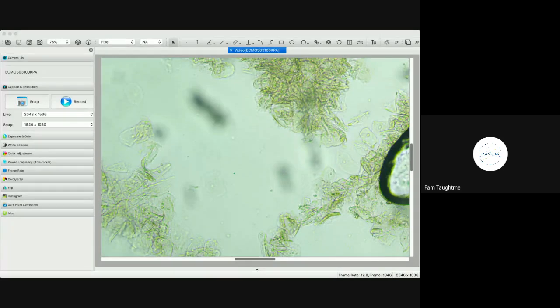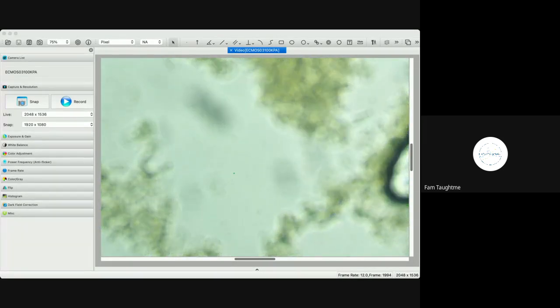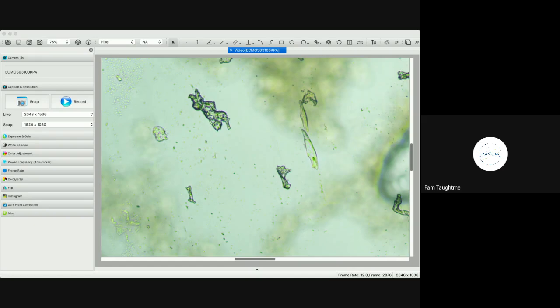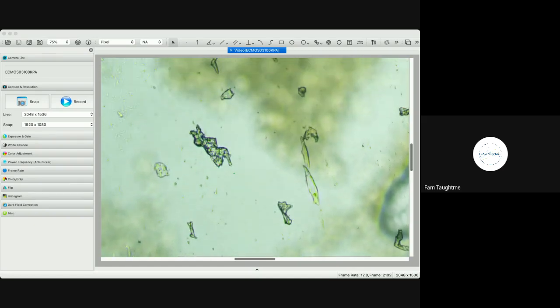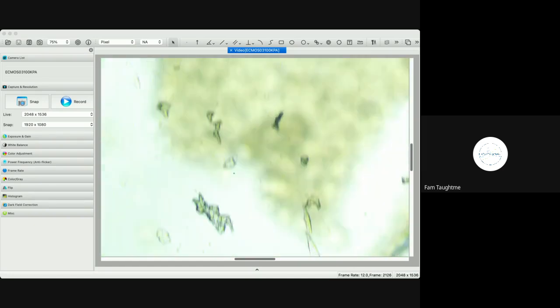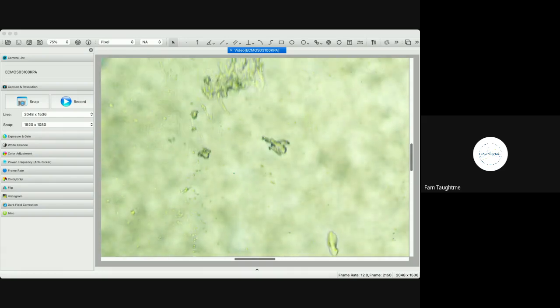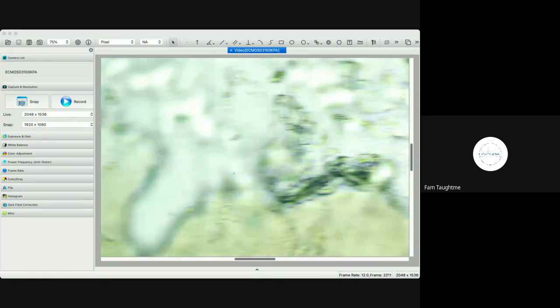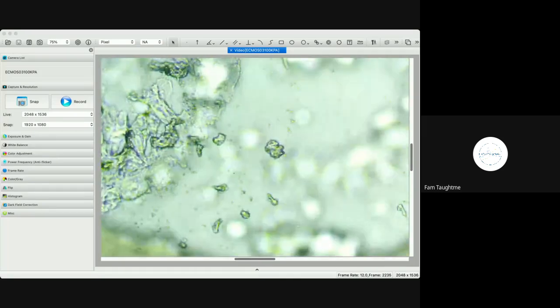Okay, so here I'm going to switch now from the cellular view of things to this, which is the level where you see the cervical fluid in terms of magnification. So we see some salt crystals and things here. Maybe some mucin pieces, some other stuff.